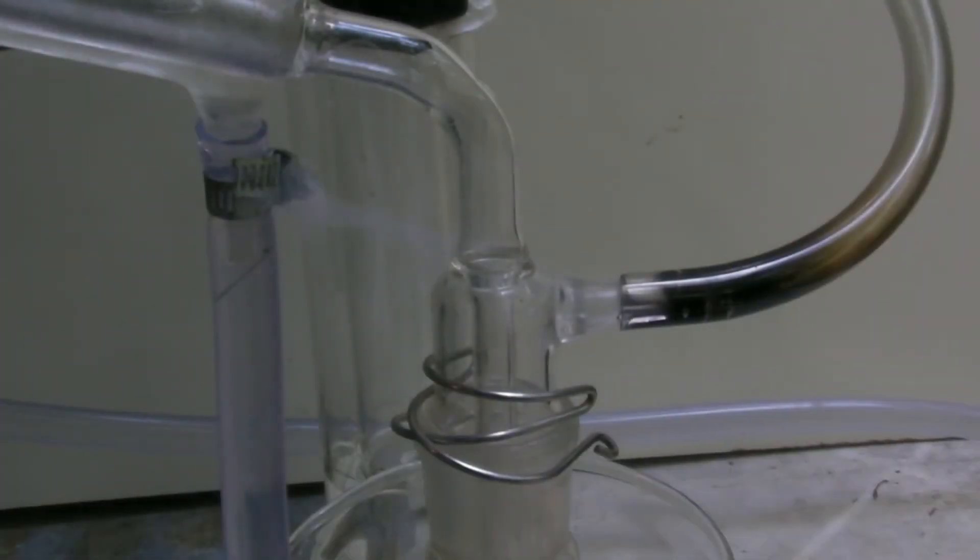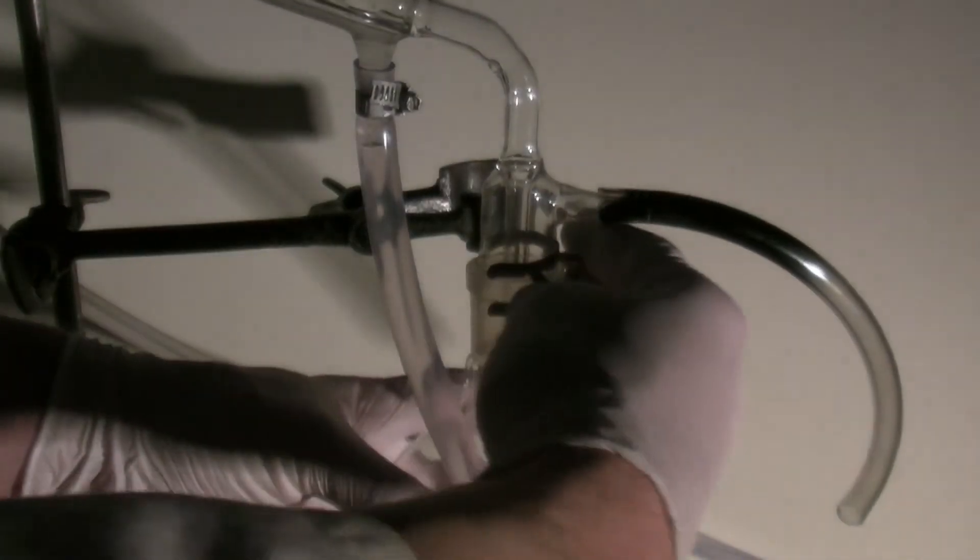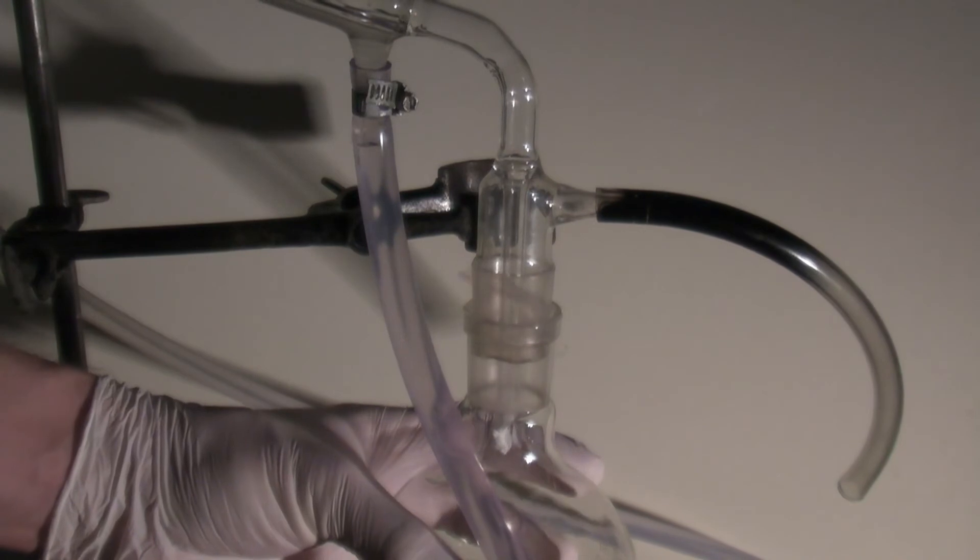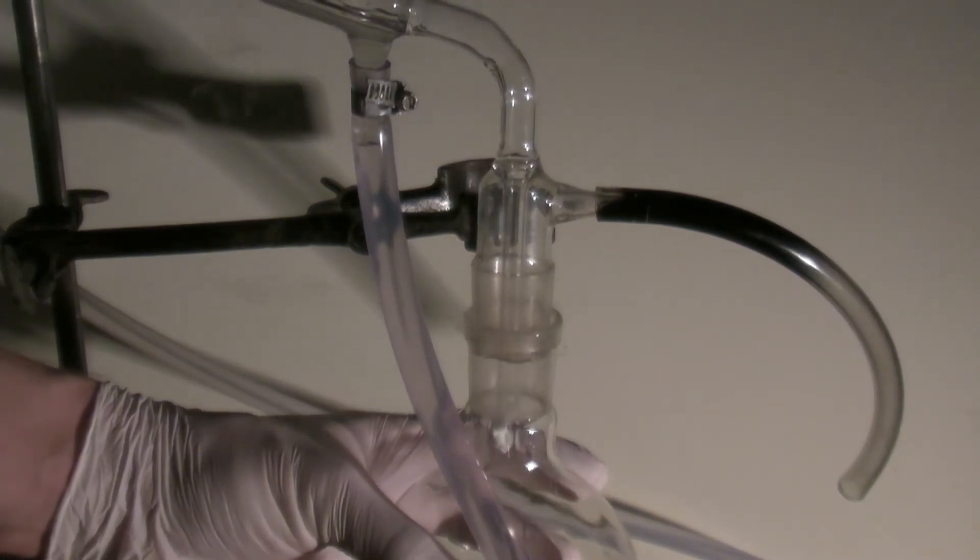The bad yield might be mainly due to the phosphorus pentoxide being several years old. The loss due to the leaking could only be a few percent because otherwise the amount of vapors would have been way higher. When taking apart the apparatus all traces of sulfur trioxide have to be dissolved in sulfuric acid before it can be flushed with water.